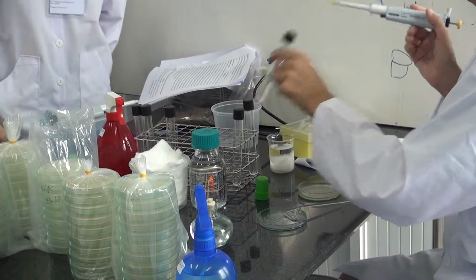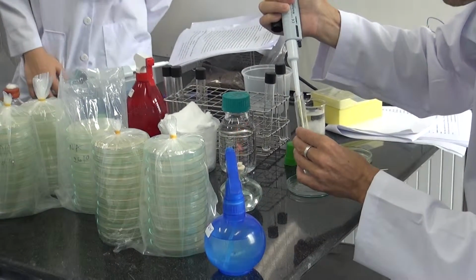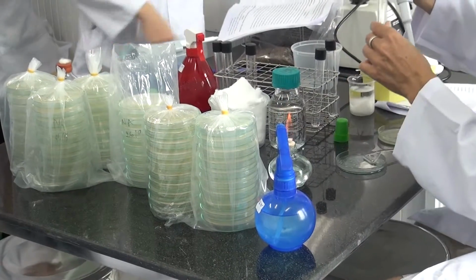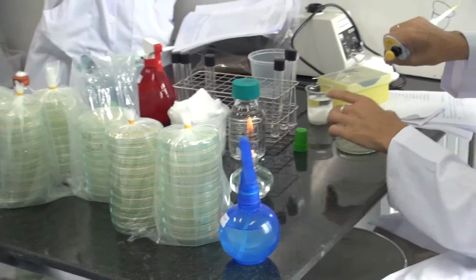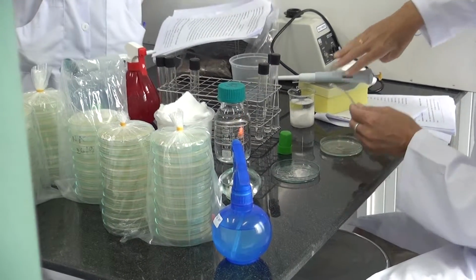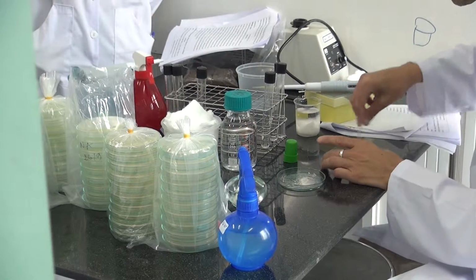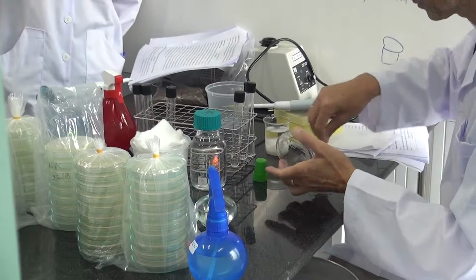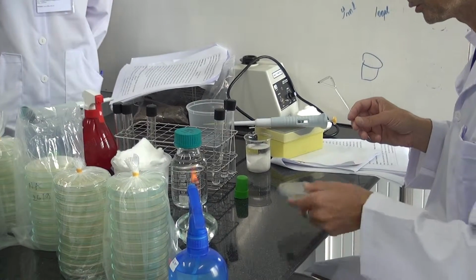We're going to do like this. Let's say take 100 microliters. Same, you go here. Go rapidly. Take your sample. Yeah, maybe it's better to have this first shot. Okay, and turn it. This should be sufficient. Okay, now when this is done, you turn it back.